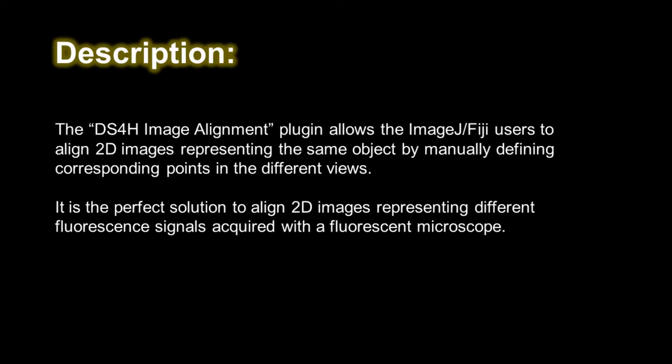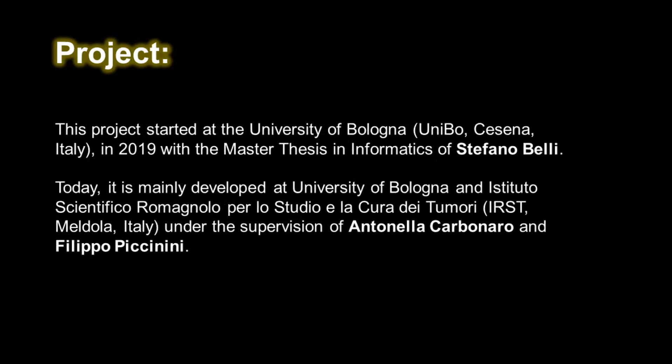The Image Alignment plugin is a freely available software tool for aligning different views, practically different 2D images, representing the same object. It's the perfect solution to align microscopy images representing different fluorescence signals acquired with the wide field microscope.